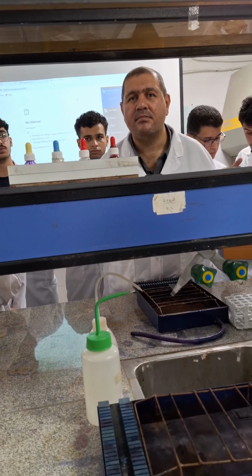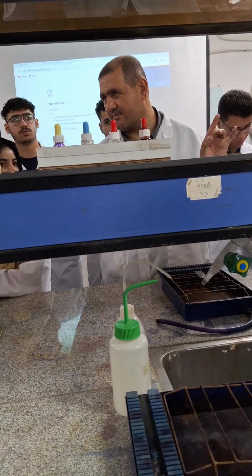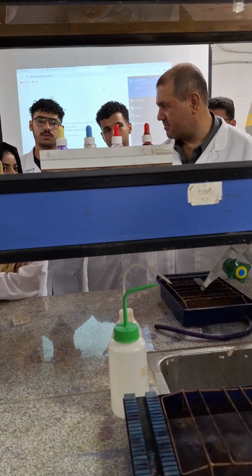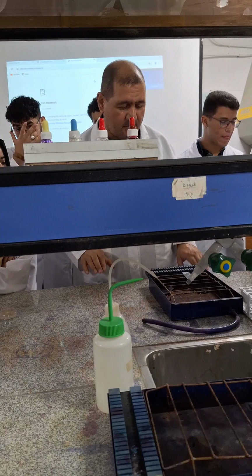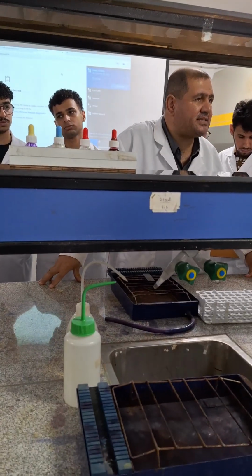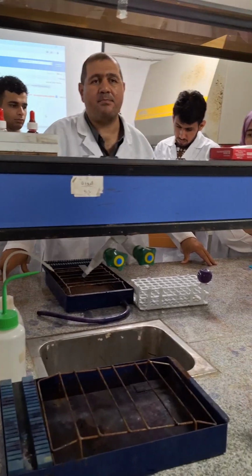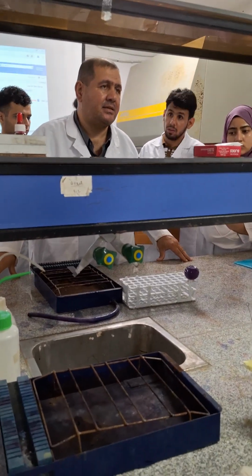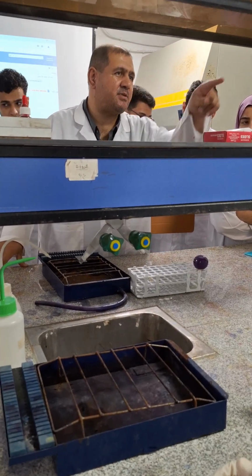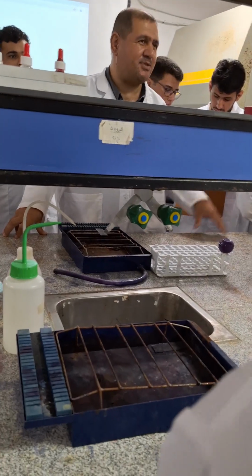What is Gram? Gram is the name of a scientist, Hans Christian Gram. For gram staining in this section, the first step is smear preparation. What is smear, Fahad?